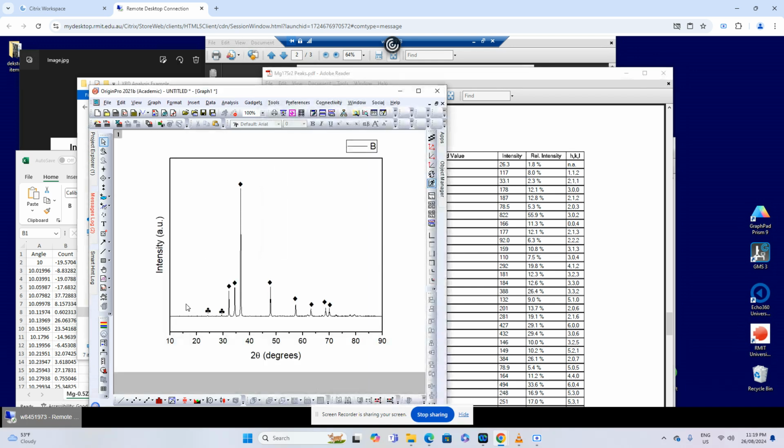So this one is like 29.4, so it corresponds to this magnesium 17 strontium 2, right? And similarly we have other peaks, we can use all peaks, then we look at what is the diffraction angle.